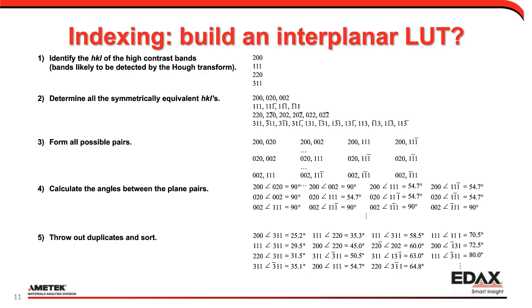And again, for lower symmetry materials, you usually have more reflectors and more reflectors at weird angles, and less symmetry. I can't throw out as many as in step 5. Because of that, in the end, this table is bigger for those kinds of materials.